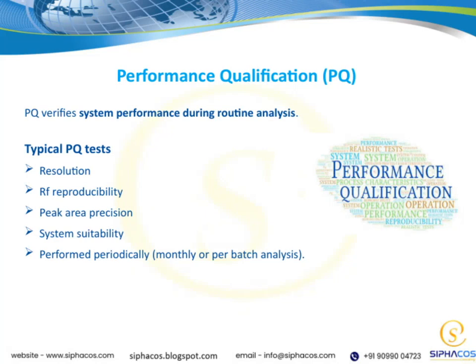Now, let's talk about performance qualification, or PQ for short. PQ is all about verifying that our system performs reliably during routine analysis. It's a critical step to ensure consistent and accurate results over time. Typically, PQ tests include several key parameters.